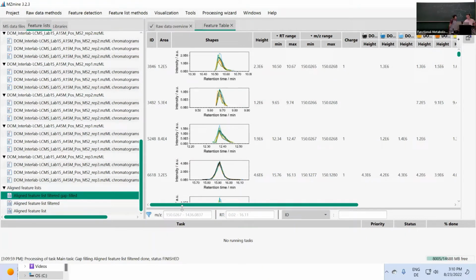And afterwards, this is now all the major steps that we do during the processing. Some people might do a few fewer steps, but overall, MZmine now offers many different modules that can work off the aligned feature list that we now have, to either export and pipe the results into data platforms like GNPS, SIRIUS for annotation, or MetaboAnalyst, or just your R pipeline that you have locally. Or we could do some annotation in MZmine.